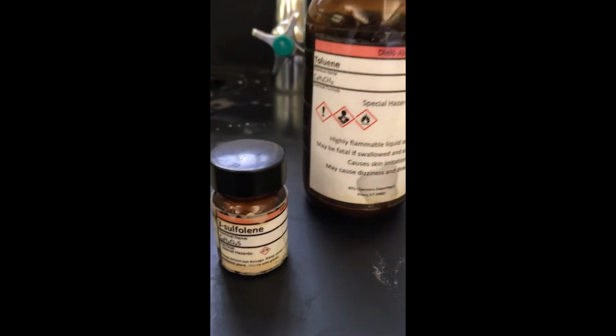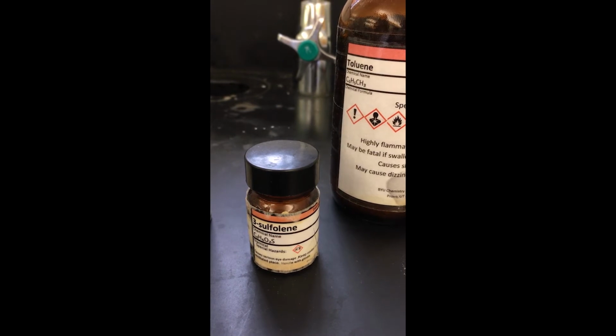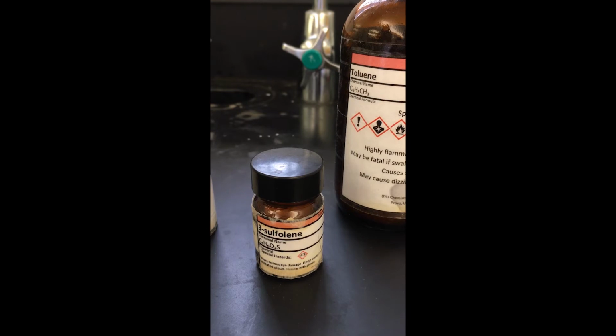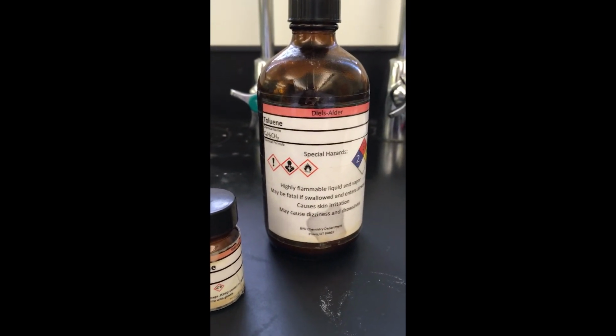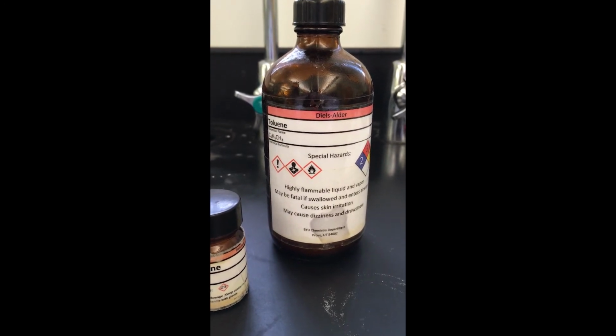And then here we have 3-sulfolene. 3-sulfolene is the chemical that's going to release SO2 and act as an equivalent of butadiene. And then finally we have toluene, which we're going to use for recrystallizing the product after the reaction is complete.